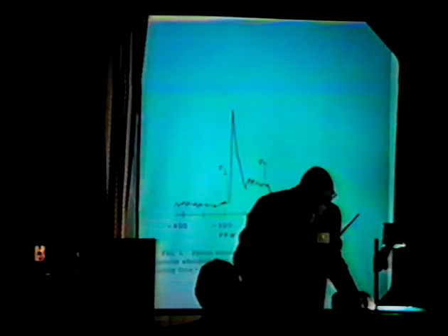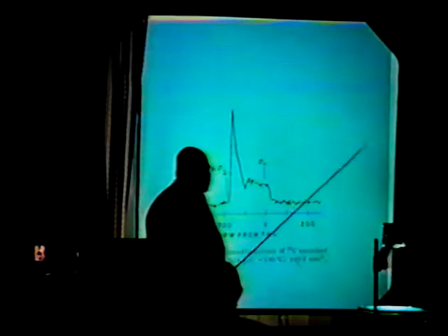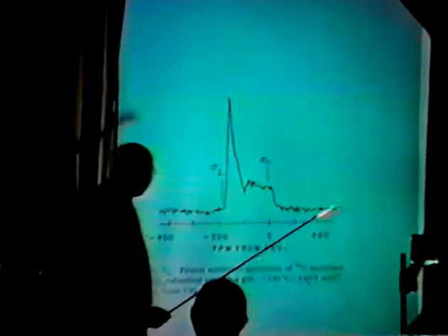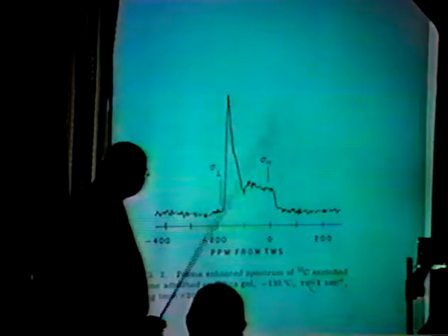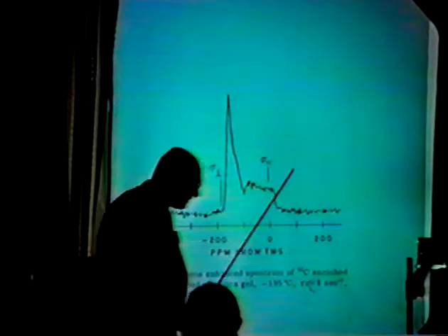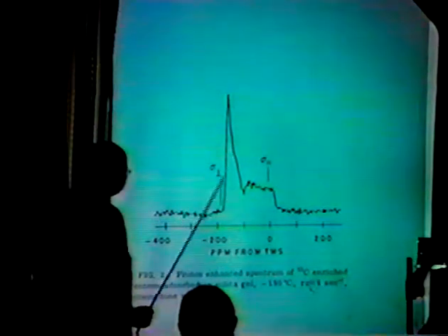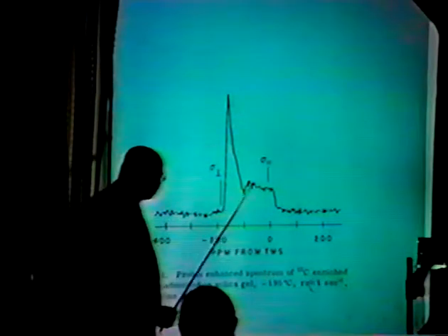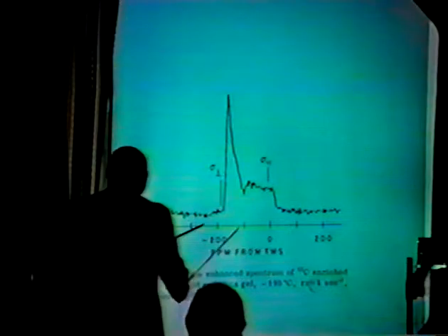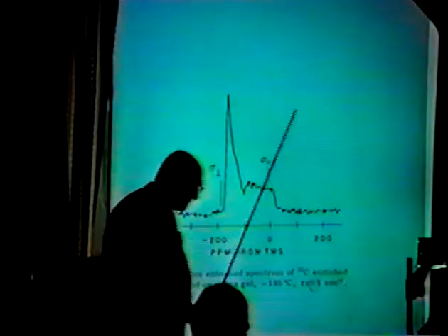Now, why would benzene have the axially symmetric powder pattern? Well, it turns out that this is completely accidental. This happens because the benzene molecule is rotating about its six-fold axis. And this gives the appearance of an axial symmetry. If you cool the benzene down to, say, liquid helium temperatures, you get what's called a completely anisotropic pattern.